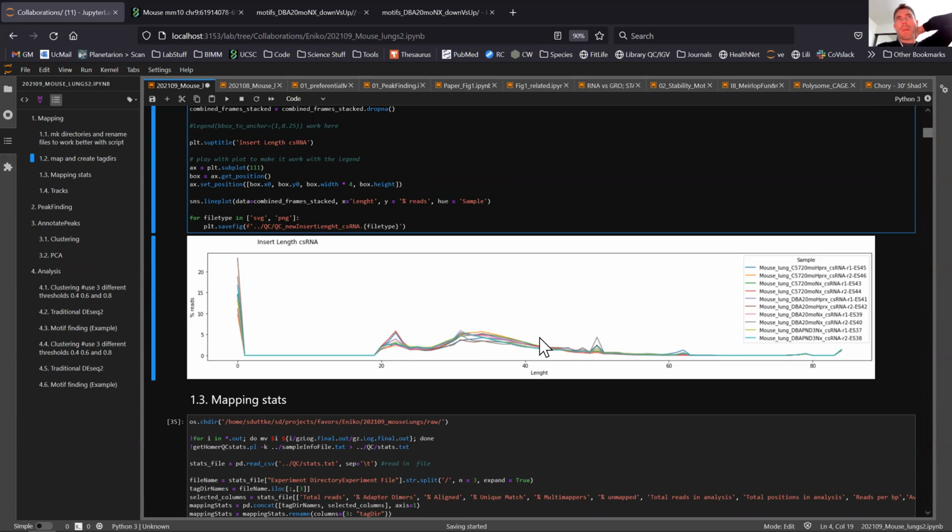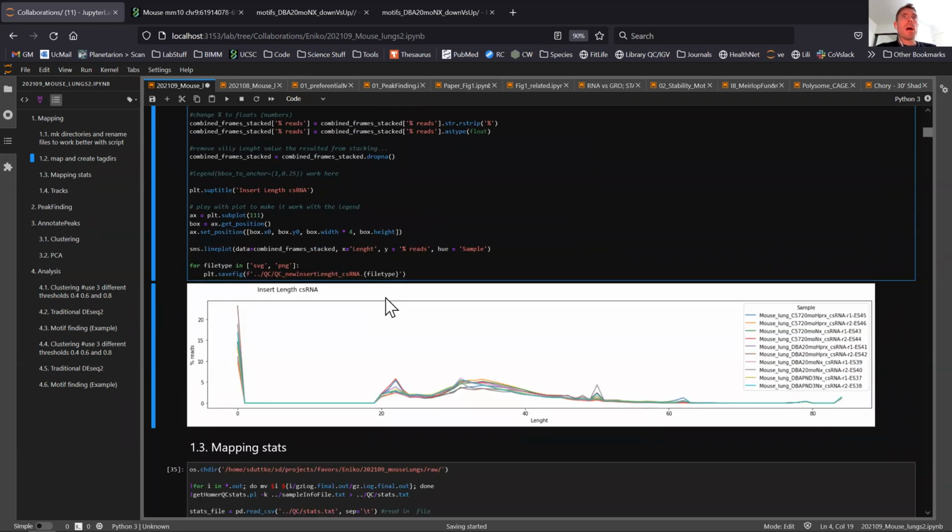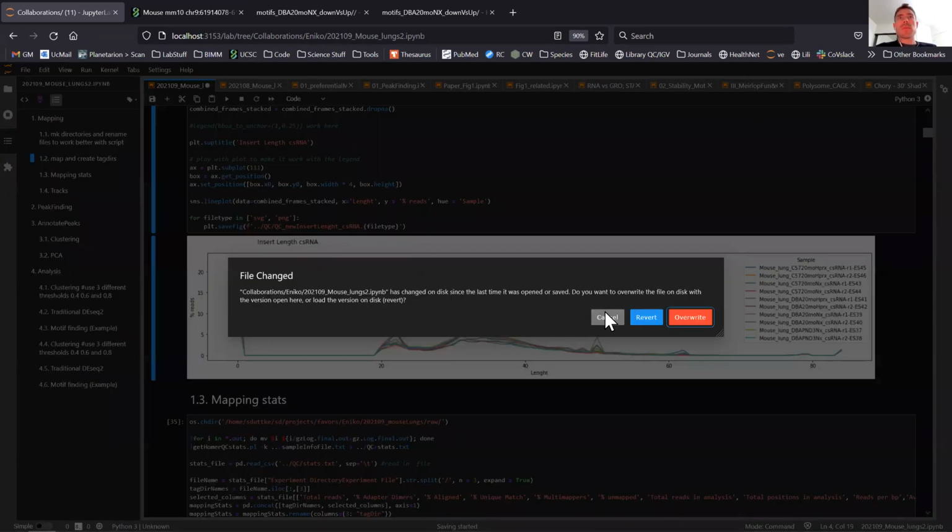And of course, you can also plot them all together by just basically putting here select something, a string that is common to all of them. Let's say in Kelly's, it would be KC or the ES, which is the sample number. So that's already good news.